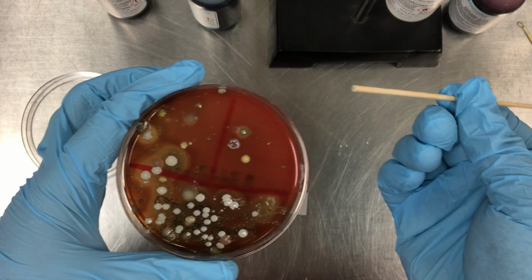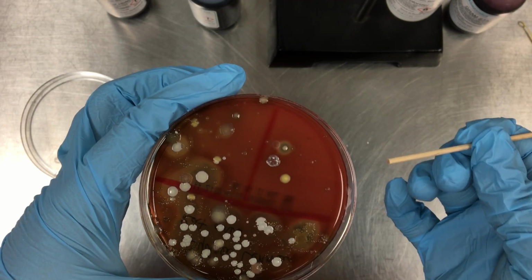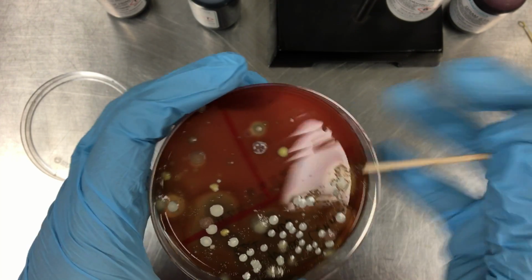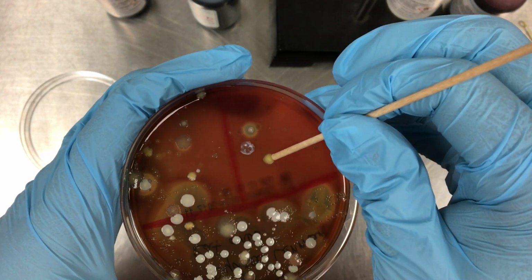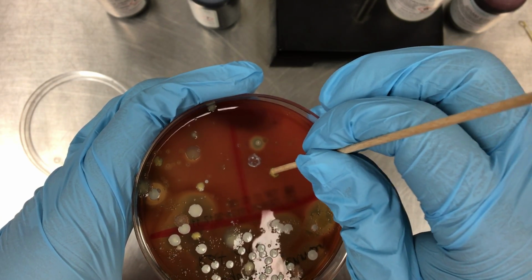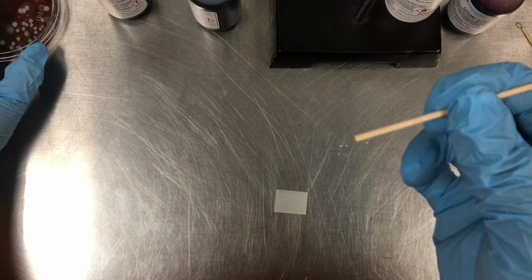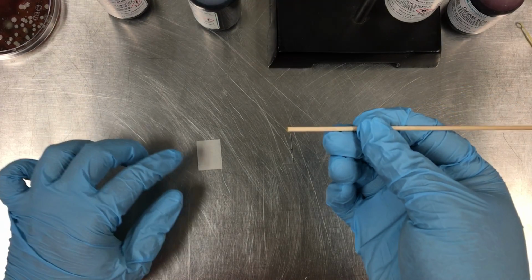So take a wooden tipped applicator and you're going to very lightly touch it to the bacterial colony that you want to sample. Since this one's already been sampled, I'm going to go ahead and just demonstrate on this creamy yellow colony here. You don't want to push too hard because you don't want to pick up any of the agar, because the agar will interfere with the gram stain. And now I have it on the end of my wooden tipped applicator.